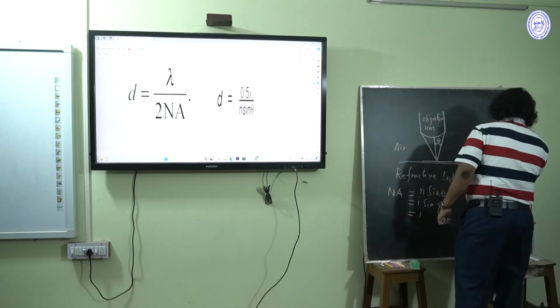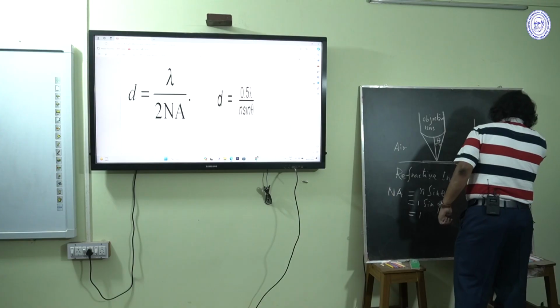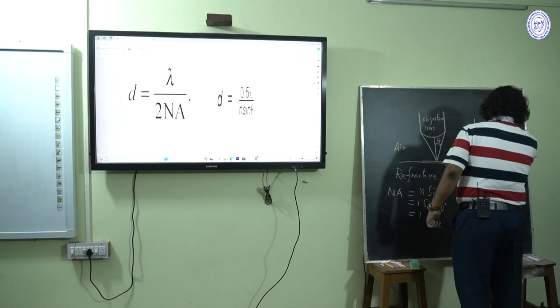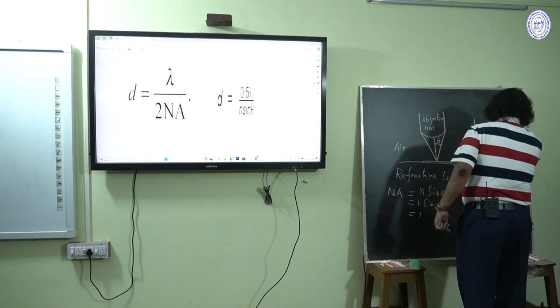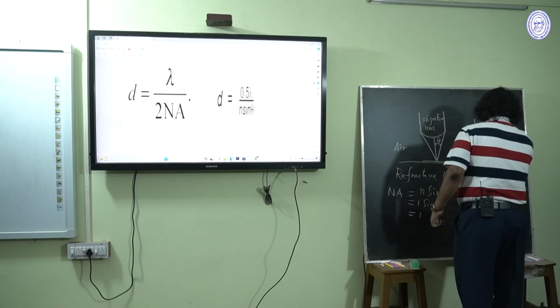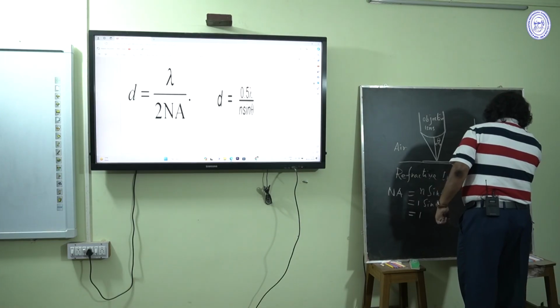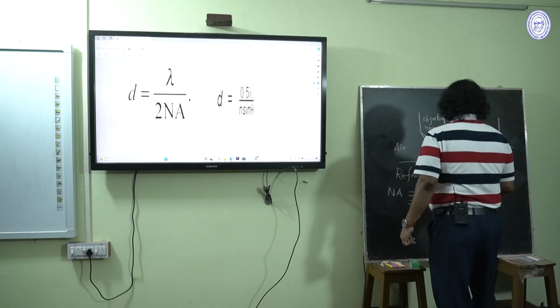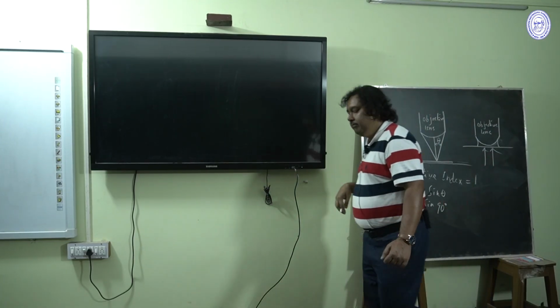Another thing is the objective lens. I am coming to that point.